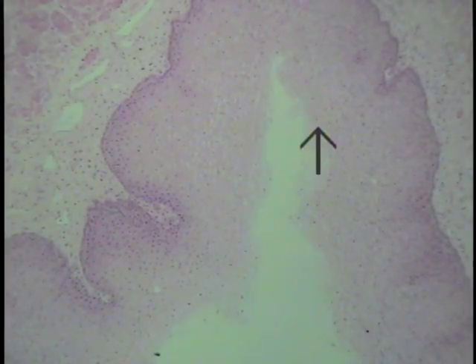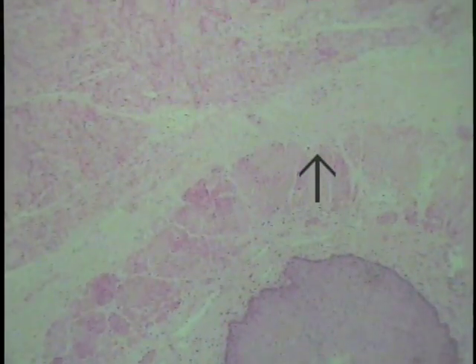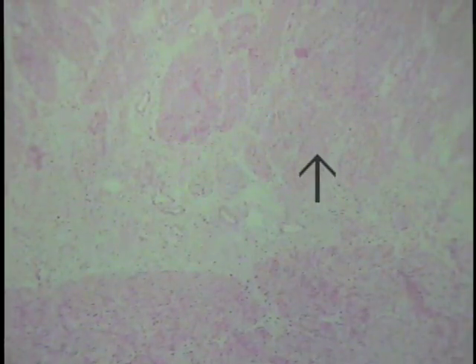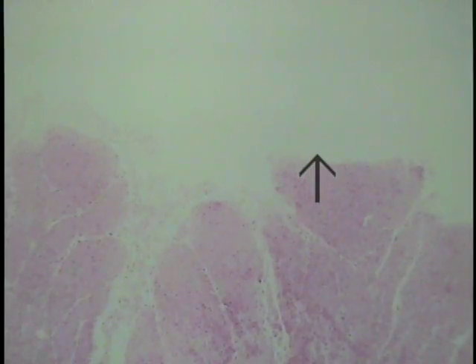Begin your examination of stratified epithelia by looking at a section through the esophagus. Once again, determine the esophageal lumen, which is shown here at the pointer. And if we course through the wall of this particular tubular structure, you can see various other tissues being present that we need not concern ourselves with now, this being the external surface.